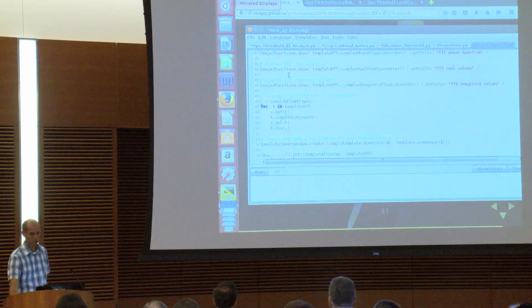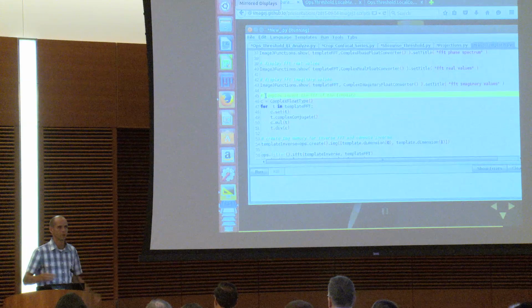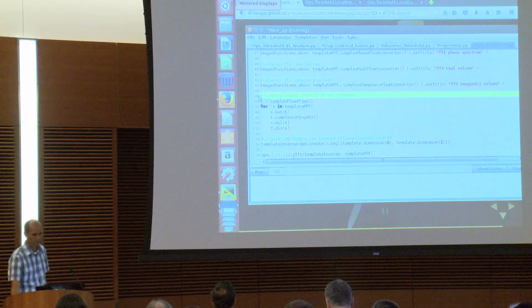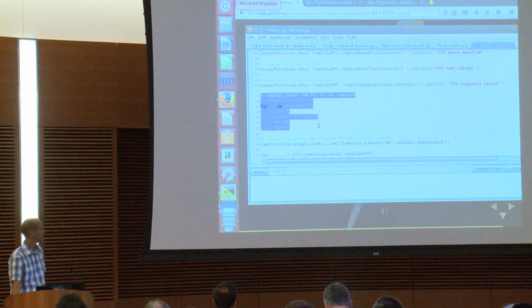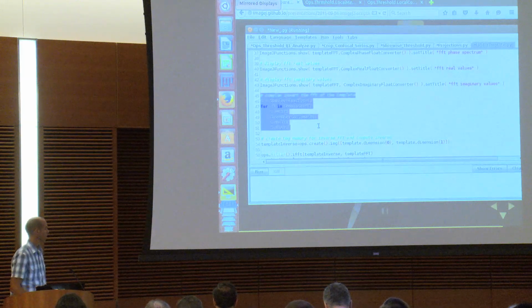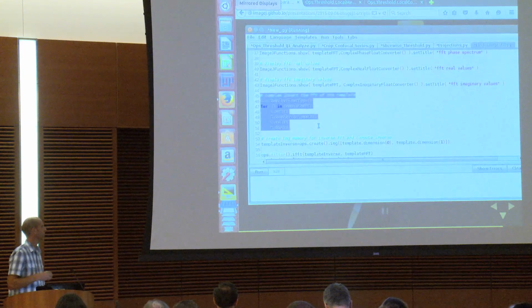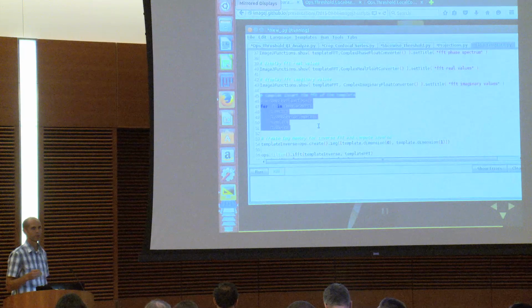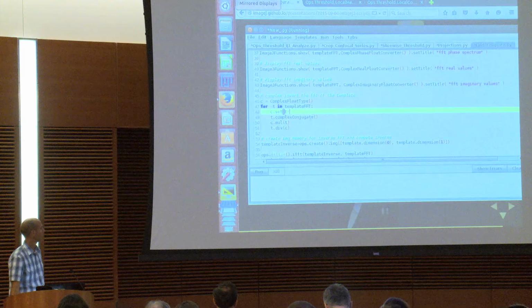And so we perform this FFT. The purpose of doing FFTs is that then you want to do some math or calculations in the Fourier transform domain. So that means we have to deal with complex numbers. This snippet of code is basically ImageLib2, using ImageLib2 types. This is an ImageLib2 interface that allows us to deal with any type of number, and it has little utilities to deal with complex numbers and do complex math and all kinds of other things.